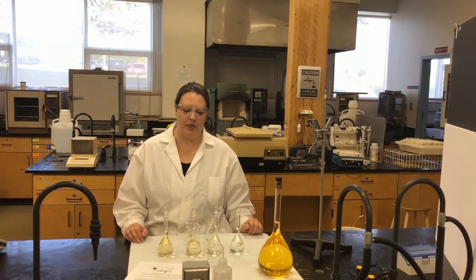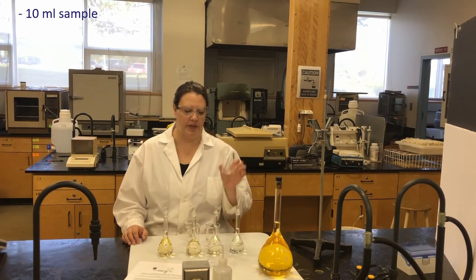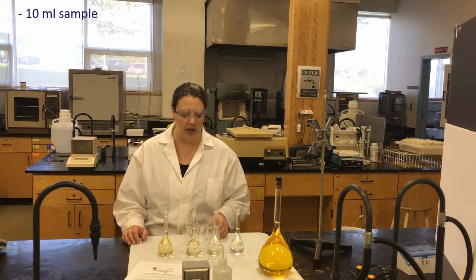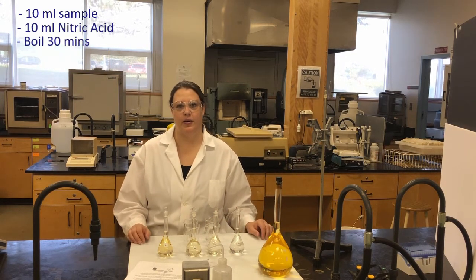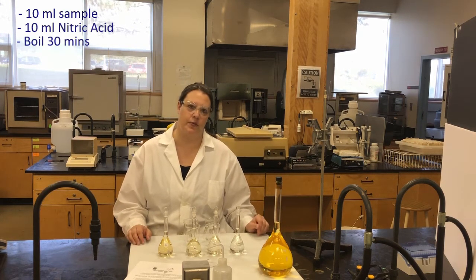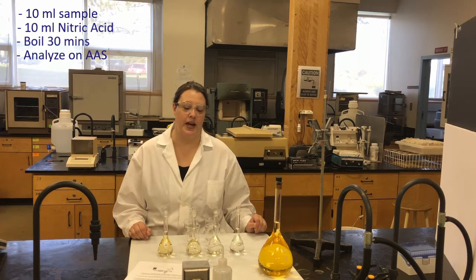For our sample analysis, there's not a lot to it for this lab. We're going to take 10 milliliters of each of our samples and put them into beakers. To each one we're going to add nitric acid, and then we're going to boil it on the hot plate in a fume hood to digest the sample. It's a fairly straightforward technique. Once it's all digested, we can filter it and then run it through on the AA.